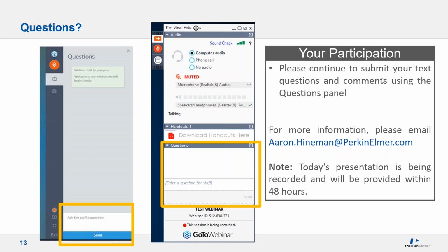Sometimes I've seen them need to be redone if service has been done to the system, optics have been realigned or readjusted for some reason. That could affect the peak shape, how the light is projected onto the detector.